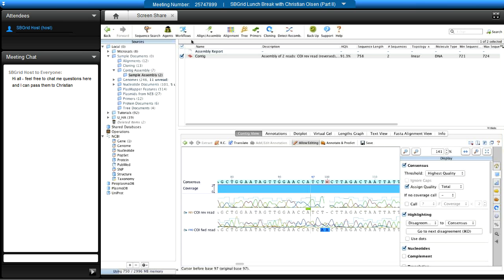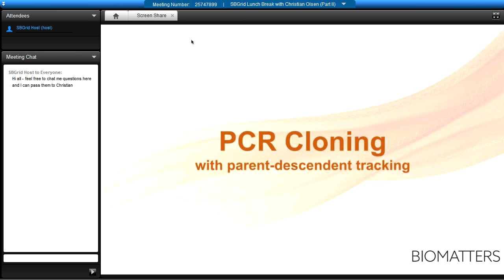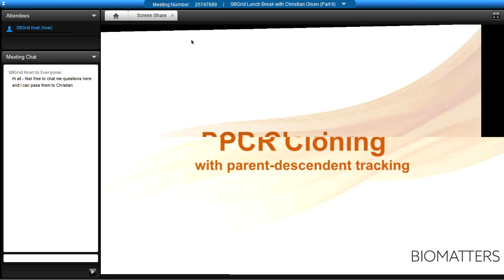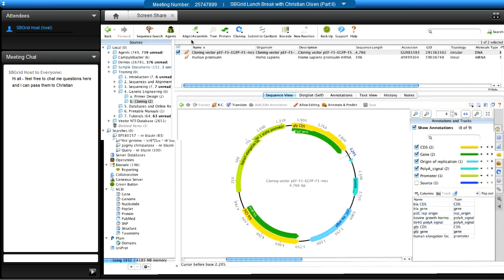Geneious manages Sanger data quite well, and Sanger data is very relevant for molecular cloning. Version 7 arguably represents the largest jump in version release, adding methods the synthetic biology community uses: Gibson assembly, TOPO, TALEN assembly, Gateway cloning — now one-step — multi-site Gateway cloning, PCR cloning with parent-descendant tracking. The parent-descendant tracking was inspired by Vector NTI — it was a fantastic idea, and I'll show you why.